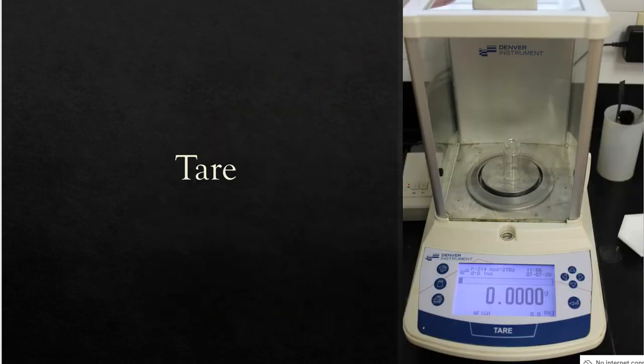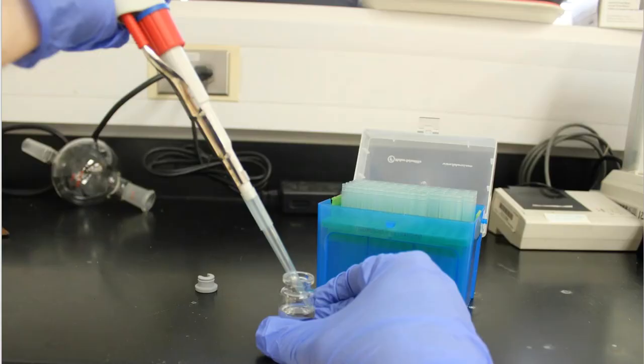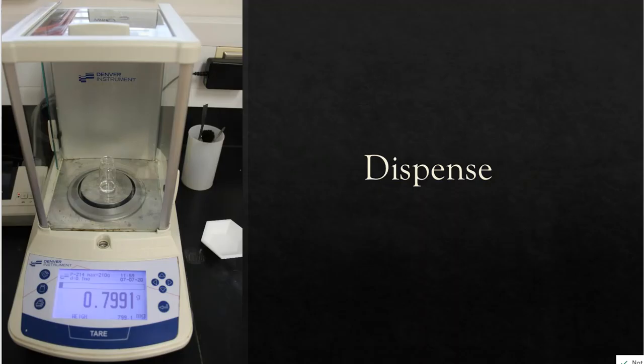So I'm going to go over to my balance, and I'm going to tare the balance, and I'll get my balance to read 0.0000. I'll then put the micropipette tip into my unknown solution, as you can see here, and then I'll slowly suck up 1 milliliter of solution using the micropipetter. I'm then going to dispense that into the container that I tared out before, and then this readout is the density value for my unknown, because this represents the grams for that 1 milliliter that I dispensed.